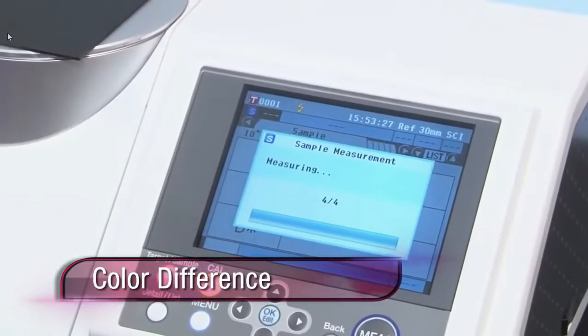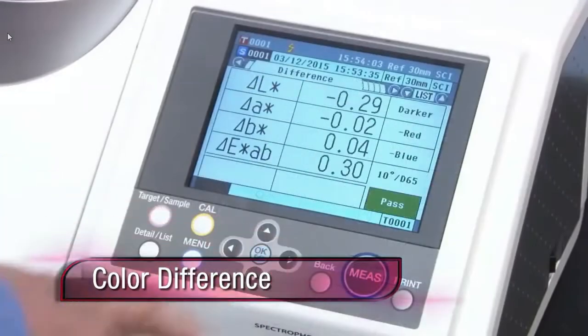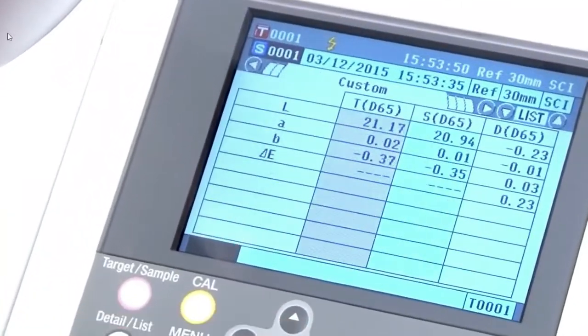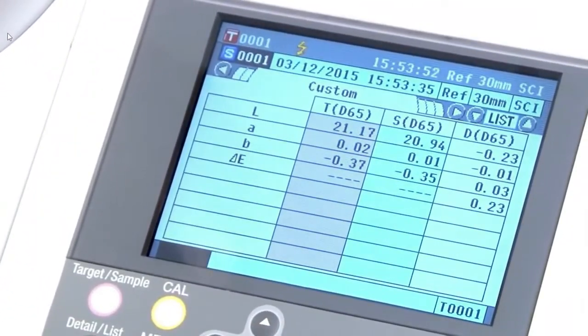The differences between the sample and standard are calculated using the resulting colorimetric values. Differences are shown numerically to identify color inconsistencies between products.